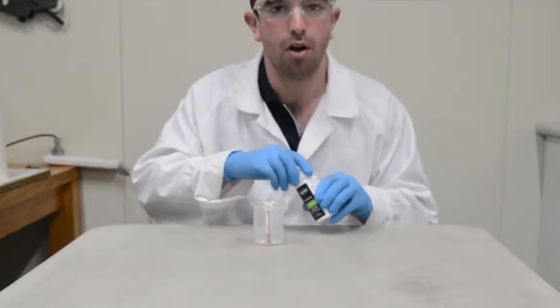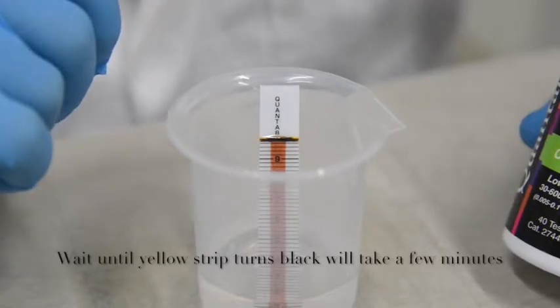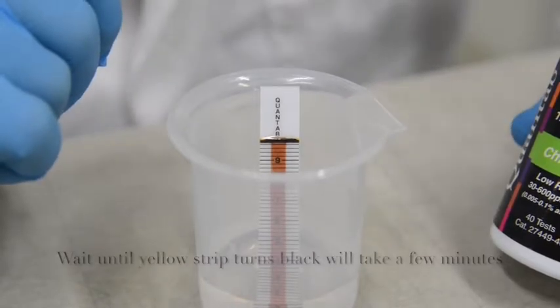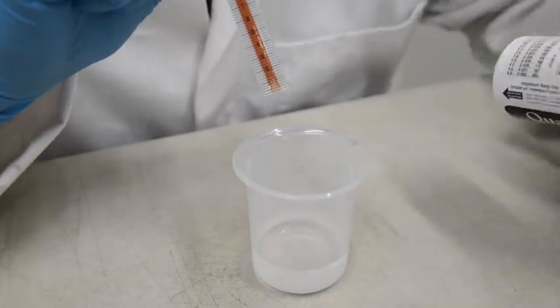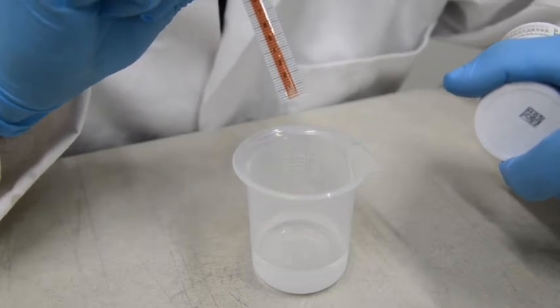Replace the cap on the test strips. With our sample here, the white peak is at 1.4, so referring to the bottle, that gives us 32 parts per million of chloride.